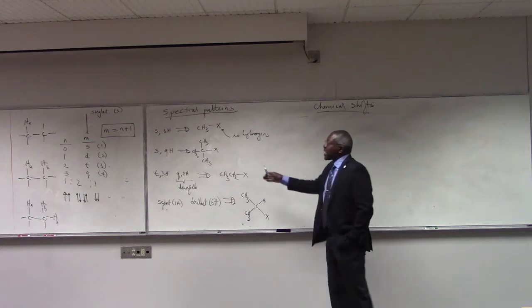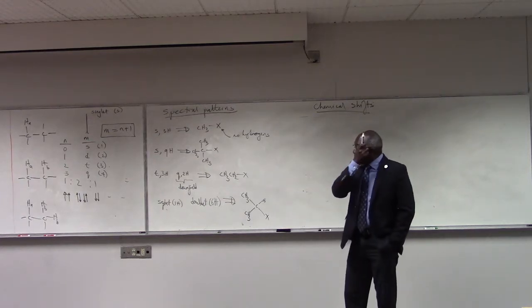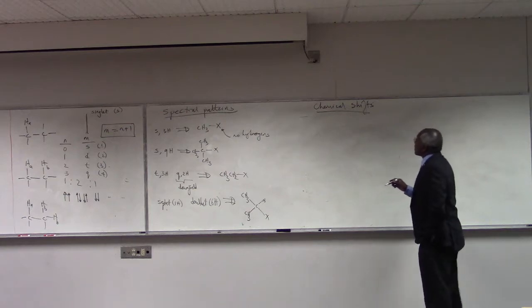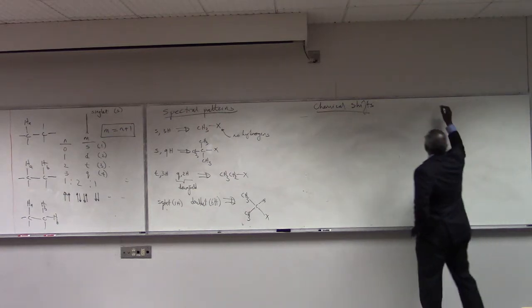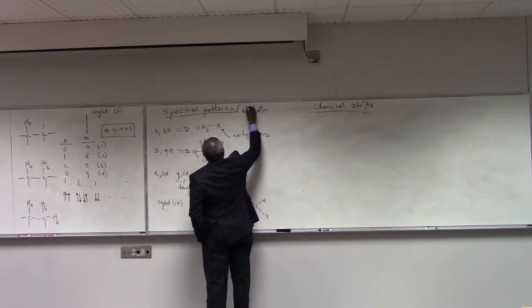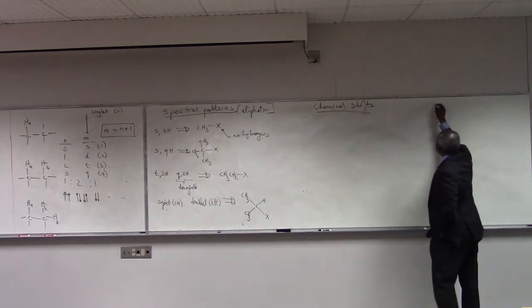So these are the spectral patterns for aliphatic compounds, in other words, compounds that are not aromatic. And we're going to do aromatic chemistry in a little bit.